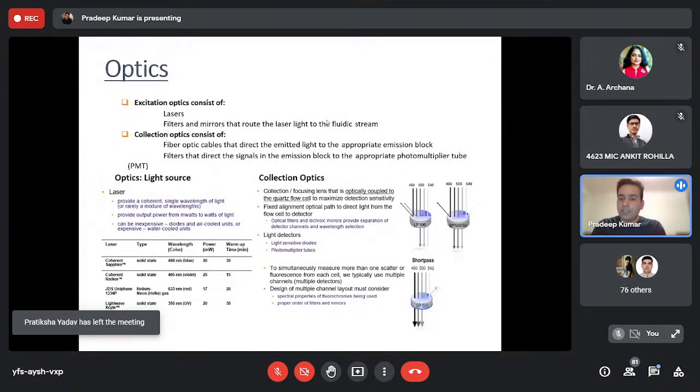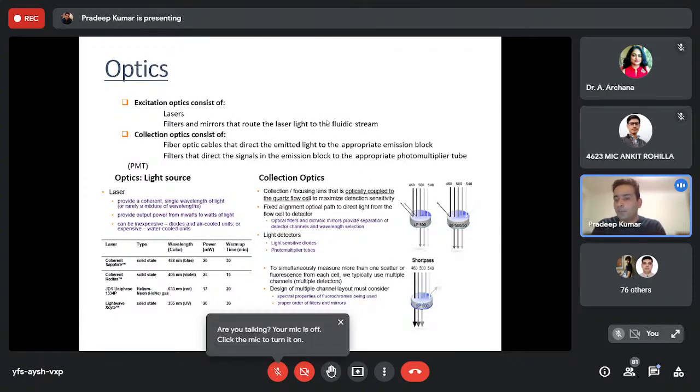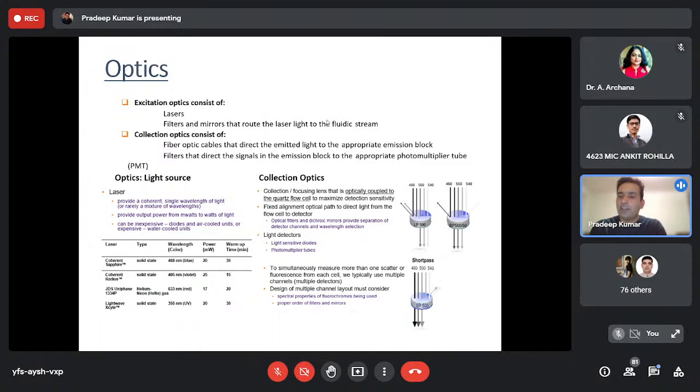The second one, the bottom one, is SP500. It means light with a wavelength less than 500 it will transmit, and more than 500 it will block. And there is a third filter called BP500/50. It is a band pass filter which only transmits a particular wavelength of light. It means you divide the second number, 50, in half around the first one.